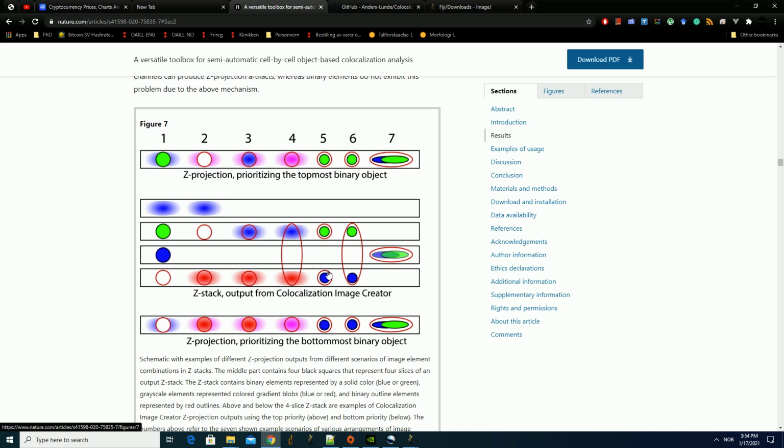Now, these terms and conditions mostly relate to your different cell populations being uniformly distributed across the tissue, that there is not any bias towards the top or the bottom, if you want to count and see the true proportion or ratio and number of these types of cells. And if they are very different in size and shape, that might also influence this technique.